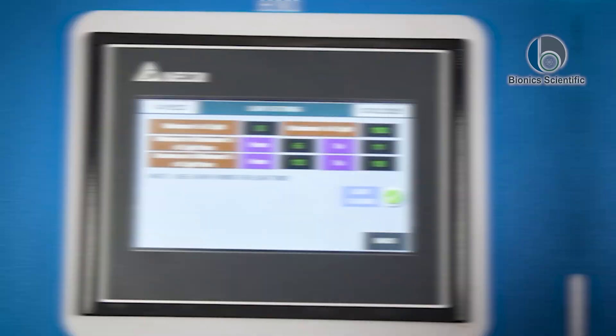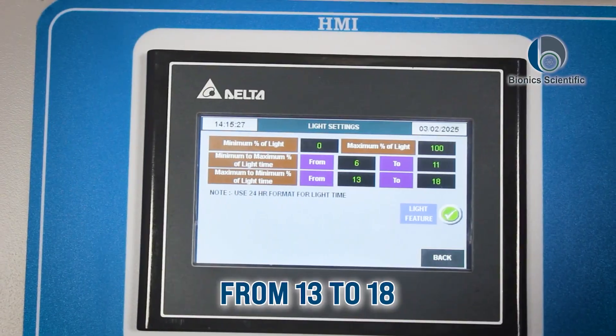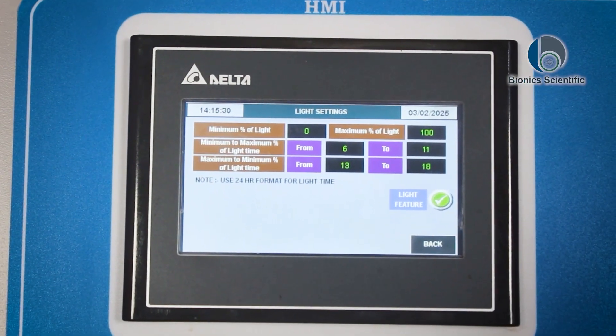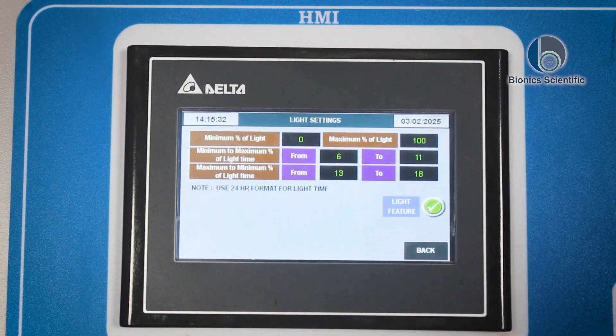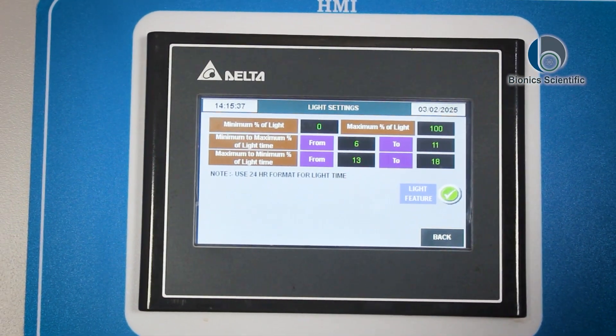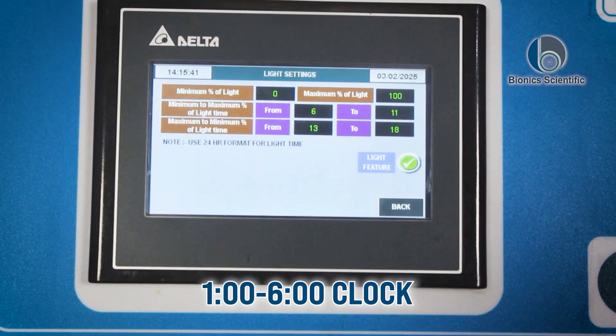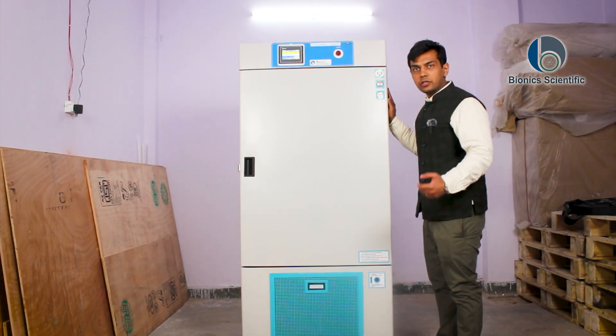The maximum to minimum light time is from 13 to 18, written here in 24-hour time format. So what does that mean? From 1 o'clock to 6 o'clock, this machine will run the lights accordingly, as we have customized it.